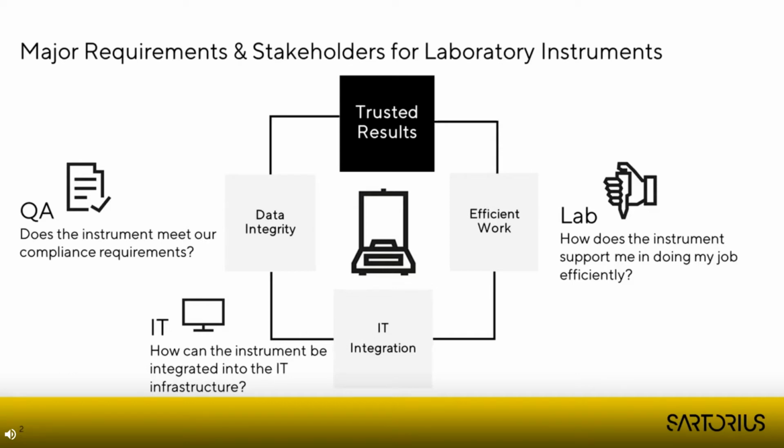When it comes to the purchasing of a new laboratory instrument, there are different interests. I think the most important is that the instrument produces trusted results, but we also have the laboratory staff who need an instrument that is easy to use, supports them in their daily work, and increases the overall efficiency in the laboratory. On the other side is QA, which must ensure that all compliance requirements are met. Especially here, it is important that an instrument supports compliance without slowing down the user in their daily work.